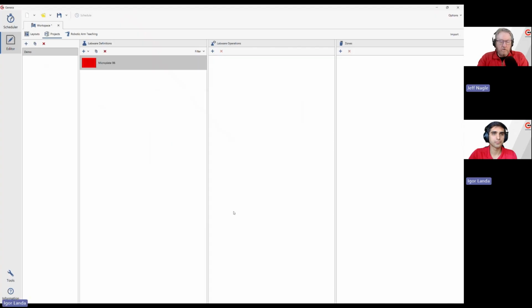Yeah, I really like the protocol one because, like you said, it allows the individual pieces of labware to say, hey, these I know are going to be run through protocol A, B, or C. So now you're telling the device, based on that labware property, this is what you're going to run, because that's what you're going to see. Exactly.